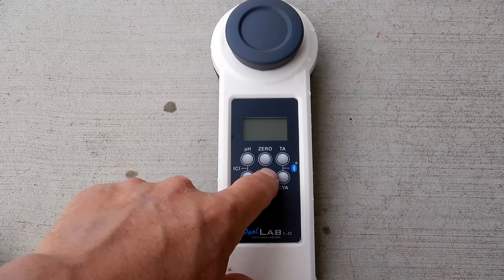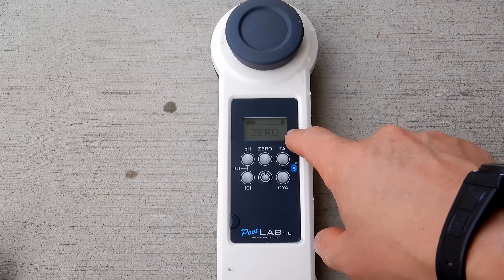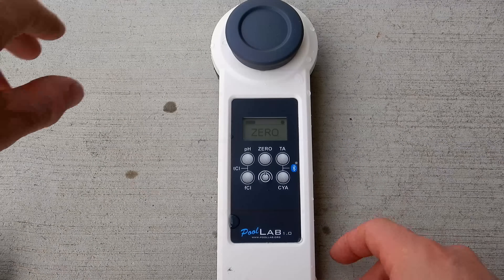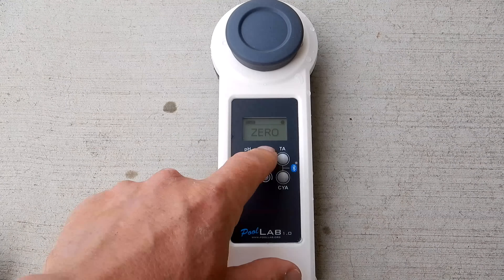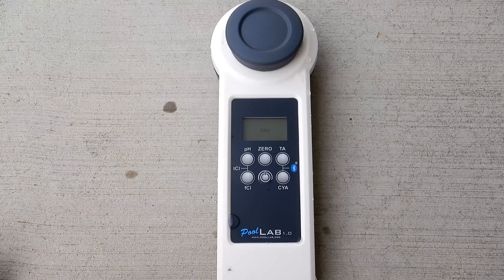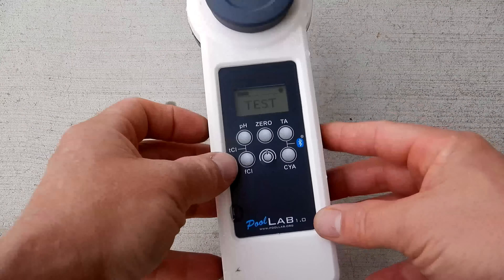The first thing you want to do is turn on the power to the unit by holding the button down in the center. Then you want to get a zero, which is the water sample in here without any of the tablets or reagents. Go ahead and hit the zero button. It'll let you know that it's ready for testing — it'll say 'test' on the screen.